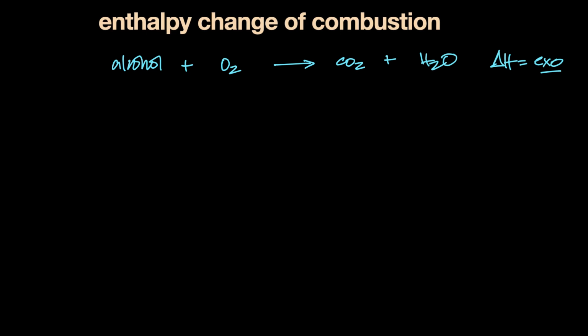So what we do is this. We can have a reaction that produces heat, but how do I find the heat evolved during that reaction? By not measuring the temperature of the actual reactant, but by measuring the heat gained by water. Now the problem is, in the previous cases one of the reactants was water, either as a solvent for acids or alkalis, or even water to which you're going to add a solid.